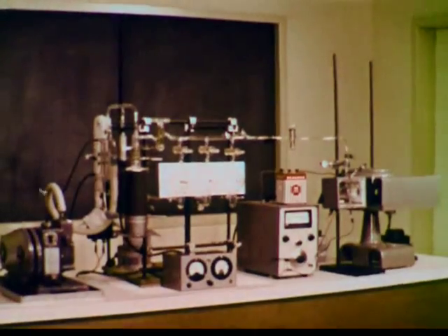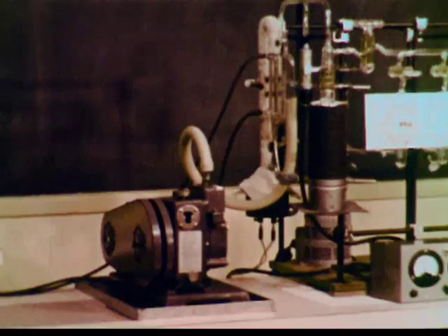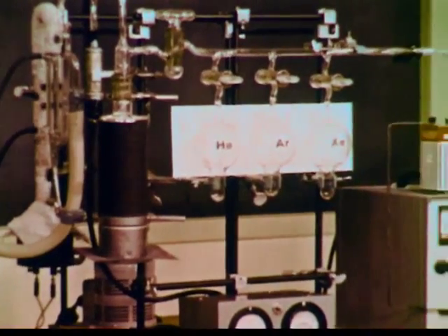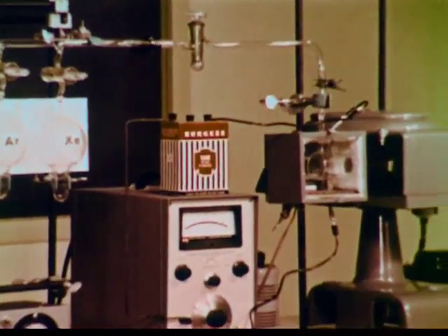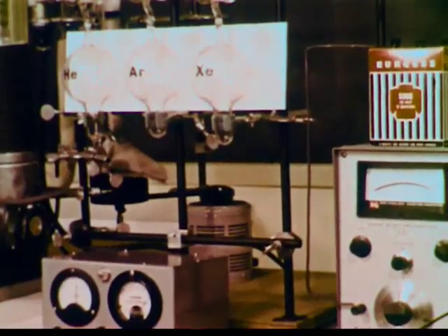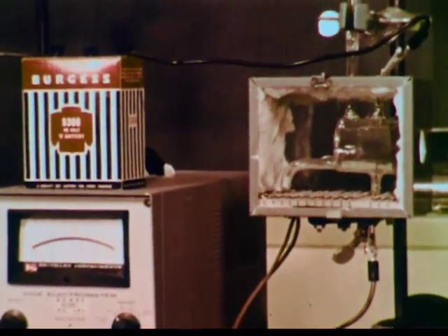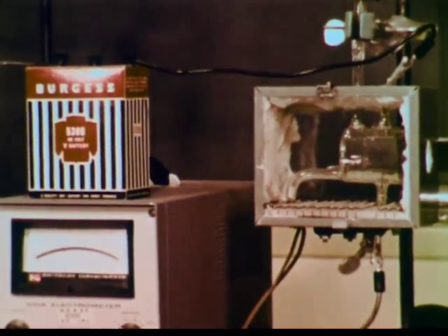Here is an experimental device for measuring ionization energy. It consists of a vacuum pump, several reservoir bulbs of gases, and an apparatus in which the electrical conductivity of gases can be measured. Ionization produces an electron and a positive ion from a neutral atom. Thus, the electrical conductivity of any gas present will show a sharp increase when ionization occurs.